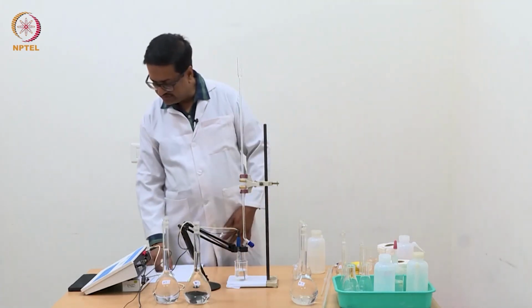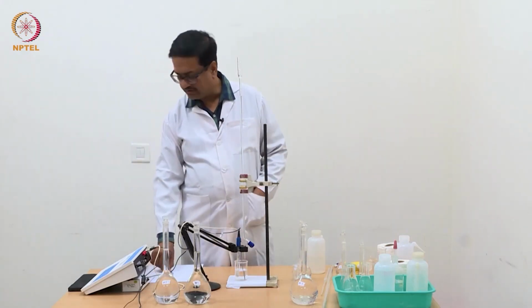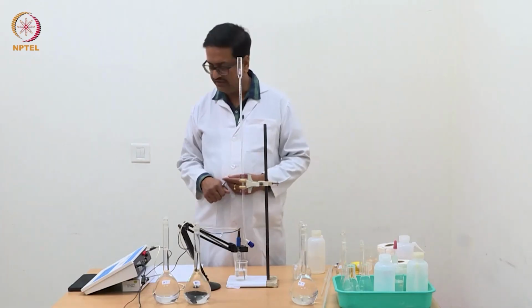So this is the pH, 3.80 at the moment without addition of any NaOH.